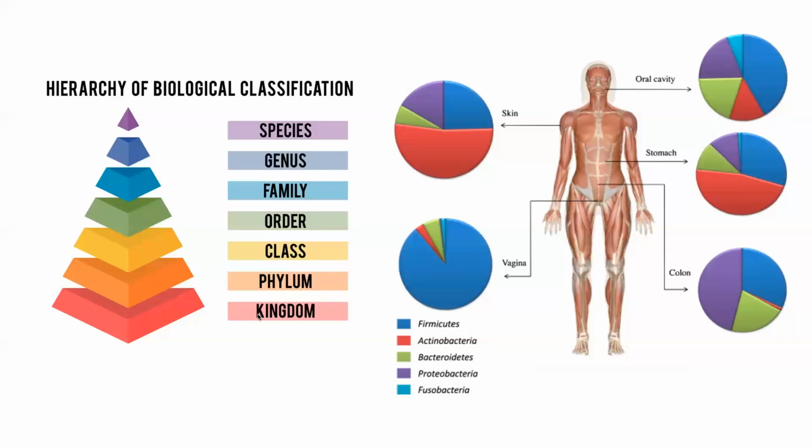So one of the useful things for us to think about when we do this kind of sequencing, when we do this kind of analysis, is how much diversity we need in order to answer a specific question.